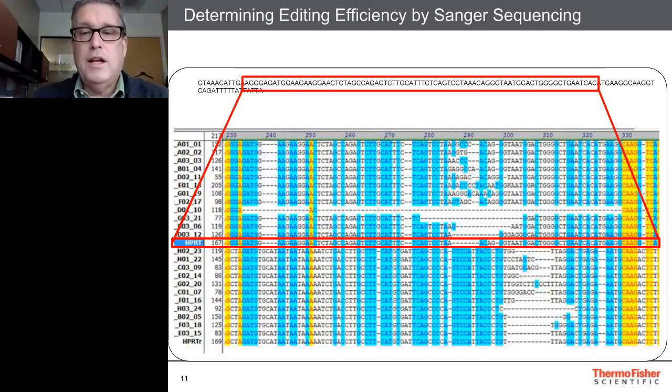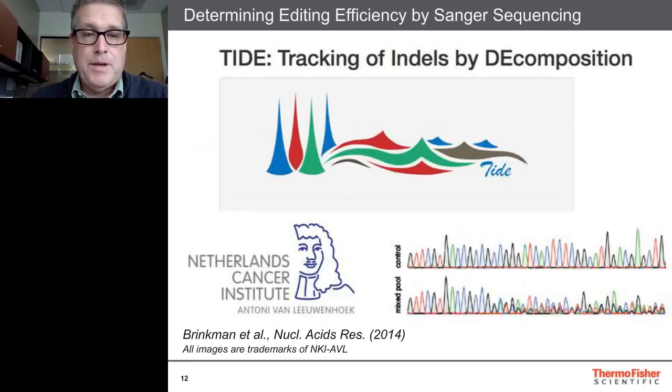The orange or the yellow with red are showing the sequences that are unedited, that are unmodified in the whole population, and you can see that a very large variety of different types of edits were made. So by counting the number of colonies that have an edit and comparing to the fraction of the 96 that contain an edit, now you can get a frequency of the editing efficiency in that particular pool. The other thing that doing this plasmid sequencing tells you are the types of edits that you can expect to see in your edited eukaryotic cells.